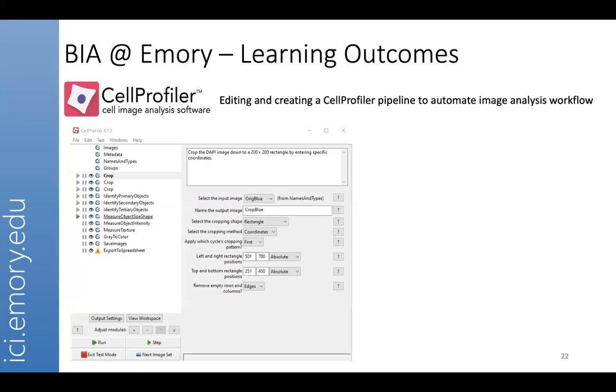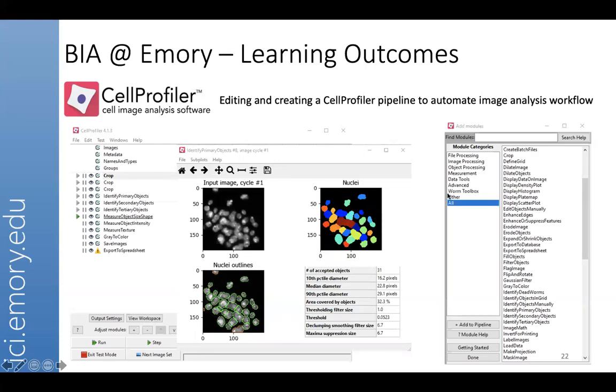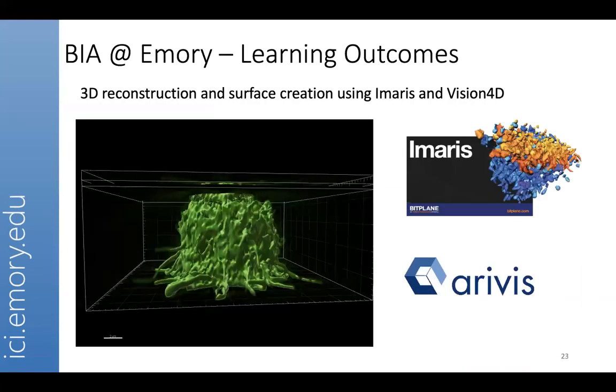You need to understand what is happening, okay? So let's say, for example, in Cell Profiler, you have nuclei and you want to segment something outside. You can use a bunch of these modules. But again, as I said earlier, and I want to re-emphasize, you need to know what each of these modules does, and hence learning Fiji is the right way to go before we reach the Cell Profiler stage, okay?